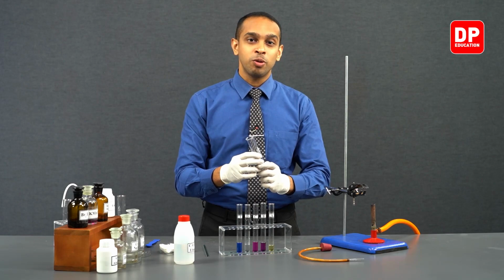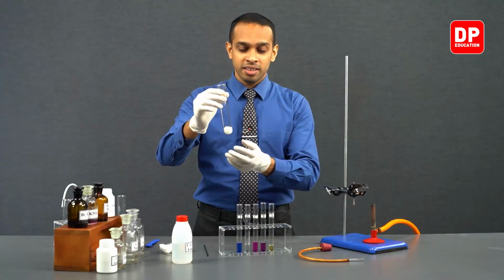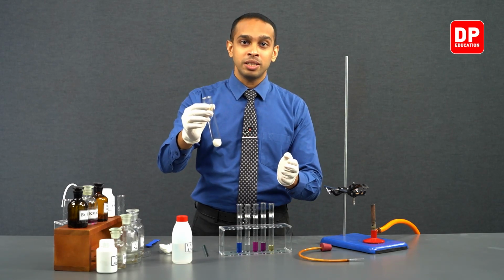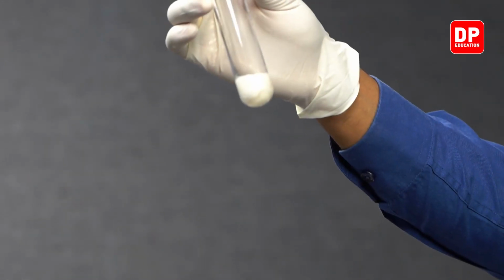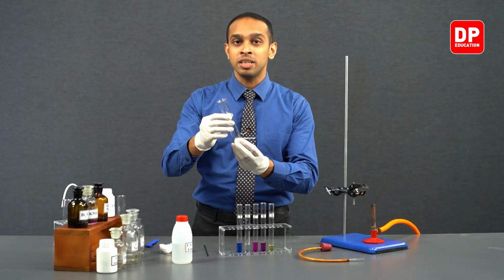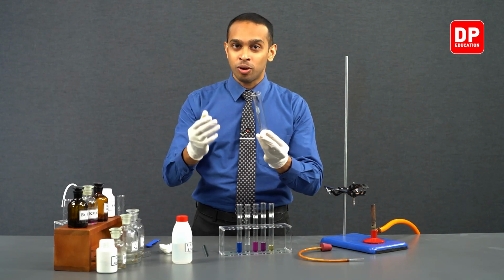Now, let's move on to adding some alumina. So as you saw students, the ethanol did not fall out of the boiling tube when we placed the boiling tube horizontally or when we inverted it, because the ethanol is absorbed or soaked into our cotton wool.